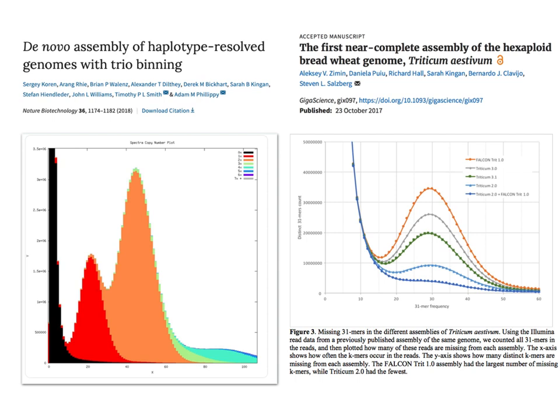Now in the figure from the right, from the hybrid PacBio Illumina assembly paper, we're showing only the missing content distributions, so the part that's normally represented by the black distribution, from different assemblies. So this helps show which assemblies are recovering more content, but also there is an interesting addition here.